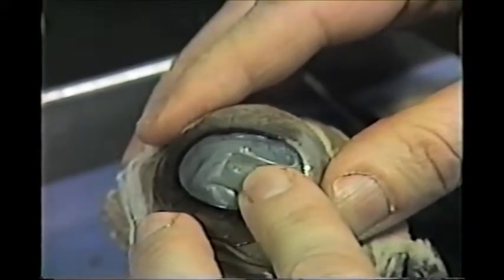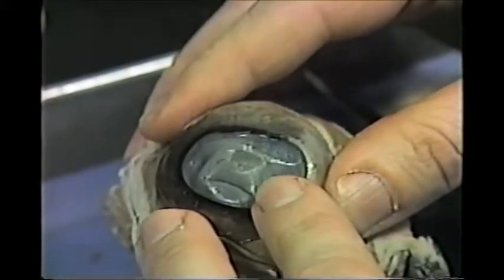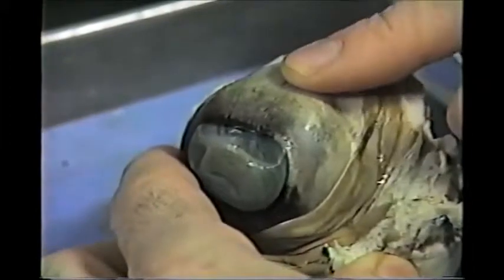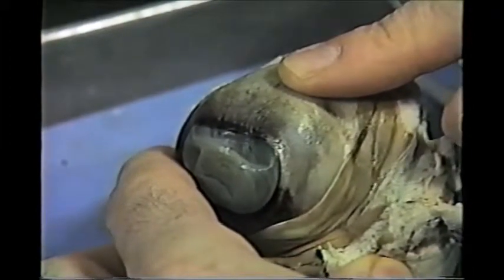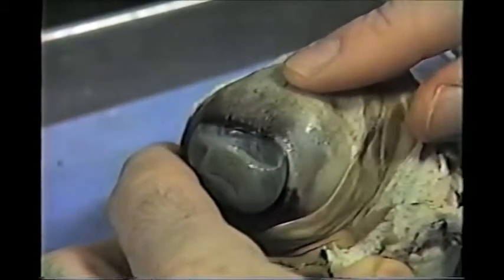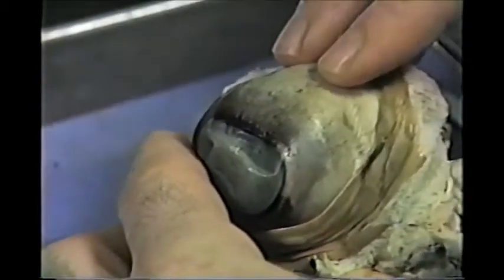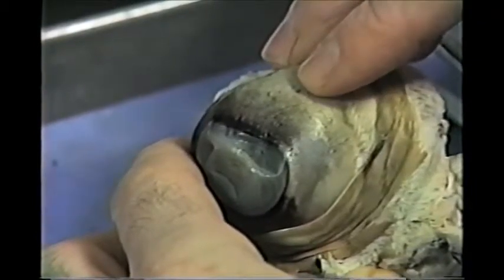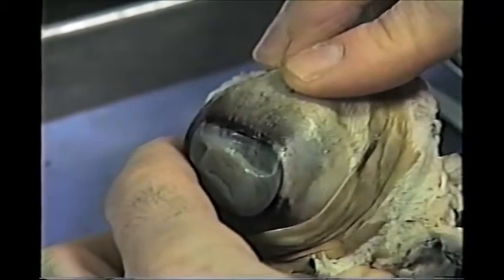The cornea is very tough and does some of the bending of light rays. The rest of this outer covering is the sclera, or the white of the eye. This is very tough, as you will find out when you try to cut into it. This is primarily for protection — it protects the eyeball.